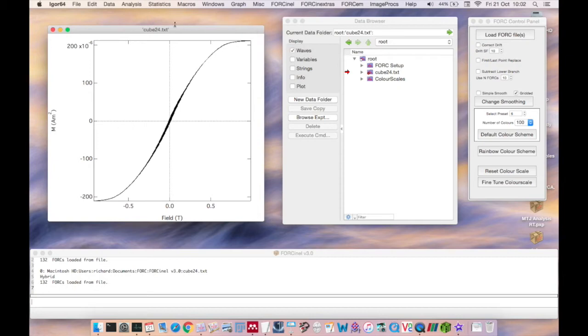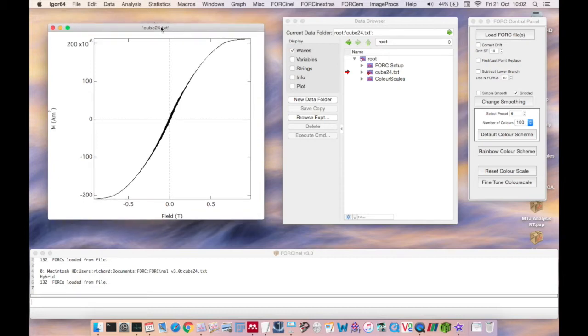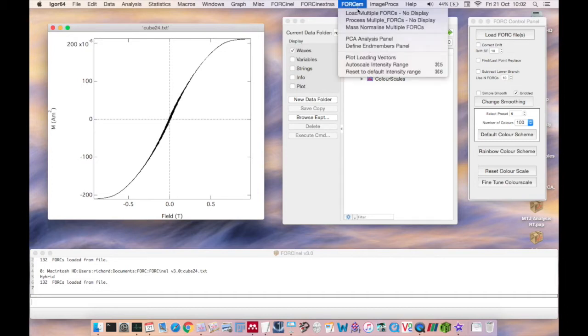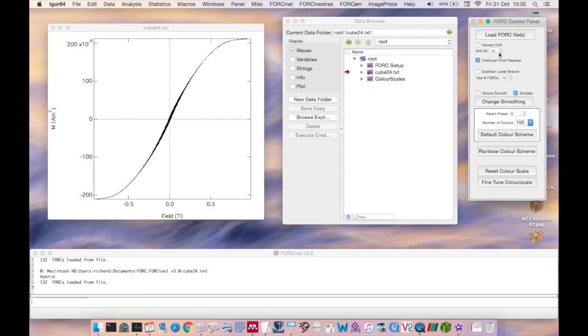When the data file is loaded, the data are displayed automatically. If you're loading multiple files and do not want the data to be displayed automatically, you can use the Load Forks No Display option available from the ForkNL menu. When the data is loaded, whichever data pre-treatment options that are clicked in the Fork Control Panel will be automatically applied to the data.